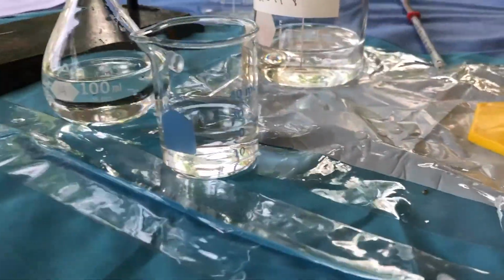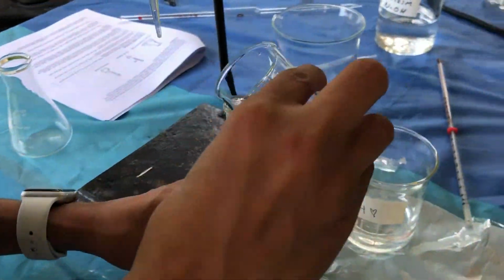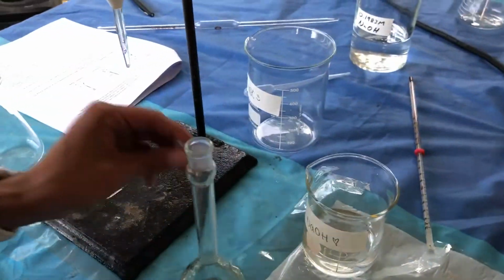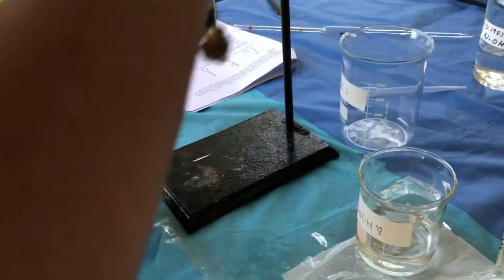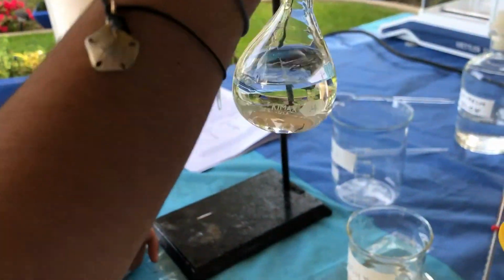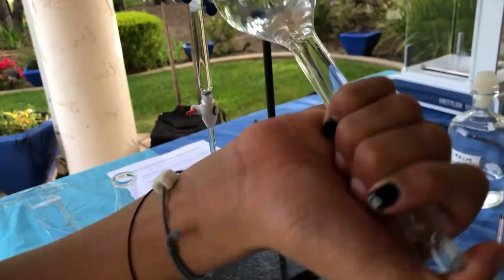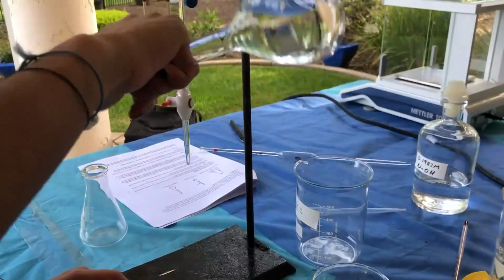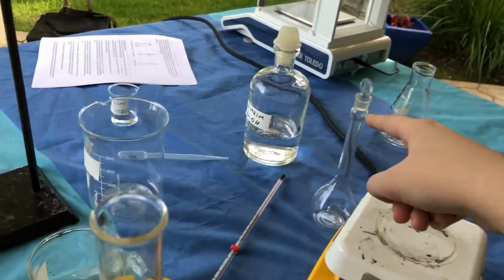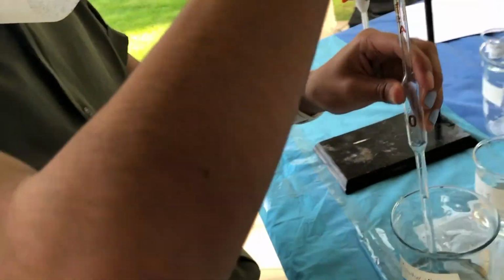Okay, so we're going to add about 20 mLs at a time when we do the little bit at a time and invert. So we filled this 50 mL beaker to 20 mLs. And then we mix it up and invert it to make it a homogeneous solution. We continue doing this until we're at 100 milliliters of total solution. We transferred the diluted vinegar from the volumetric flask into a beaker. Now we're going to pipette 10 mLs of it into an Erlenmeyer flask.